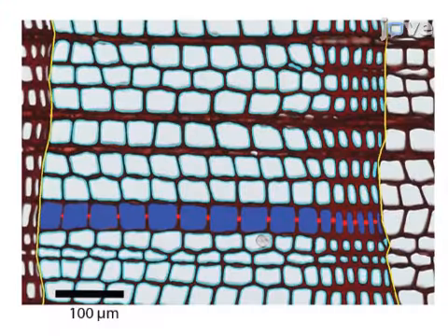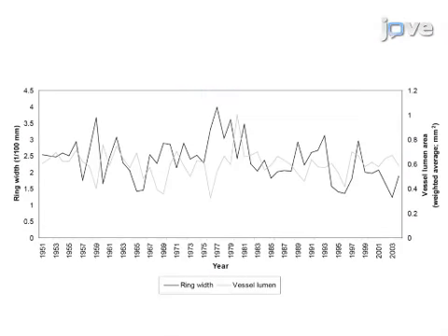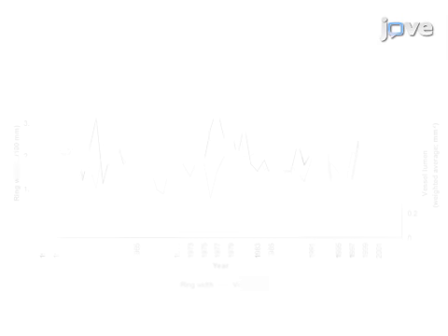Ultimately, automated cell-based analyses of the plant growth and related time series analyses can be performed to allow the evaluation of the wood anatomical parameters of interest. The main advantage of this technique over existing methods like sanding the sample's core is that with our techniques the cells are not filled with sawdust, resulting in much clearer quality samples for image analysis.